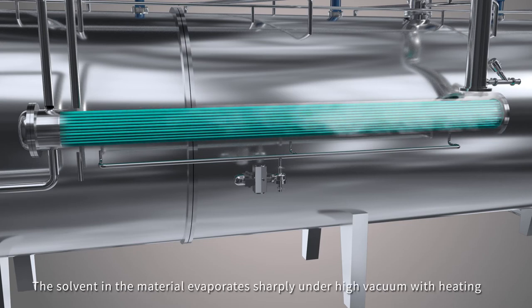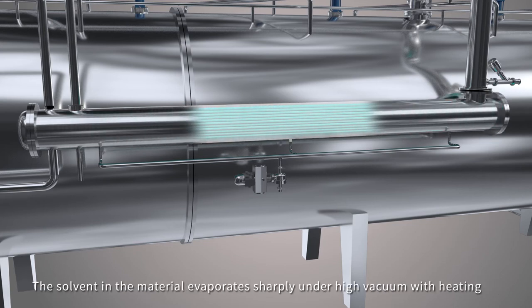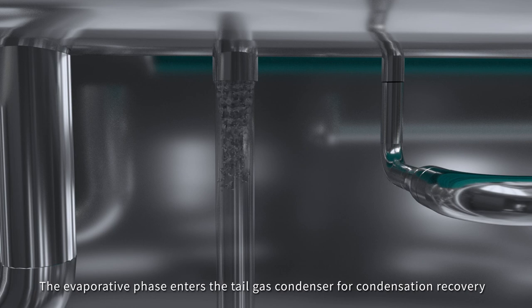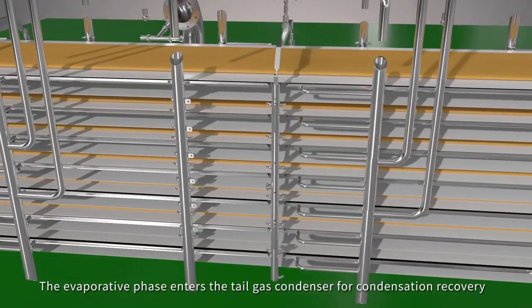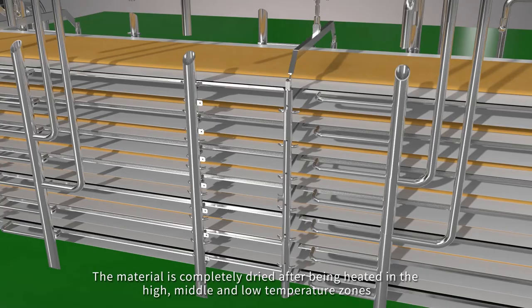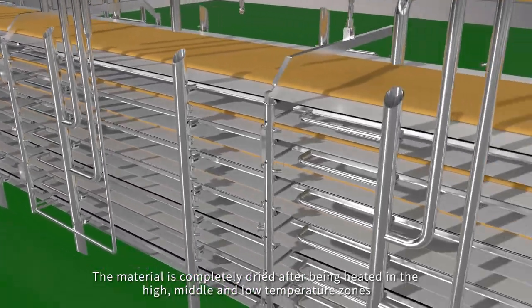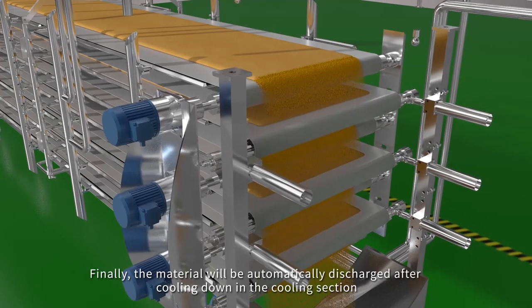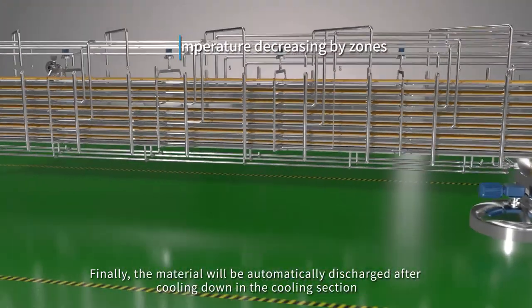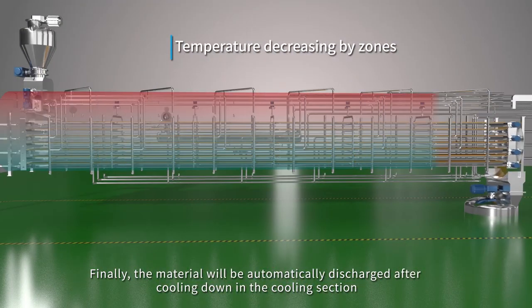The solvent in the material evaporates sharply under high vacuum with heating. The evaporated phase enters the tail gas condenser for condensation recovery. The material is completely dried after being heated in the high, middle, and low temperature zones. Finally, the material will be automatically discharged after cooling down in the cooling section.